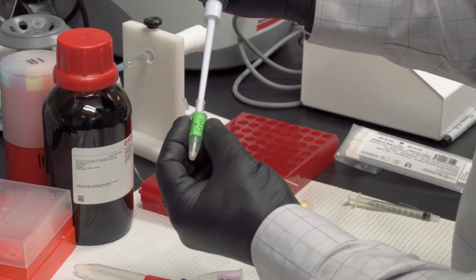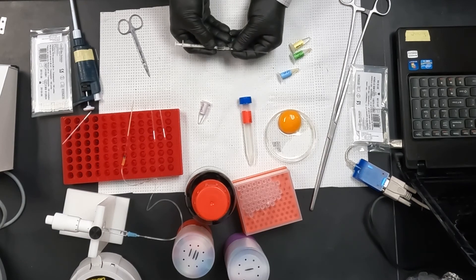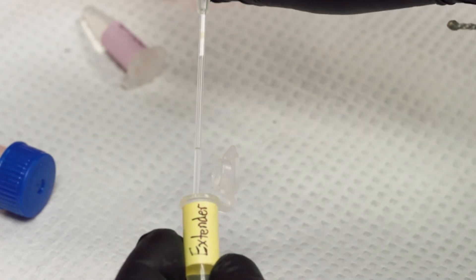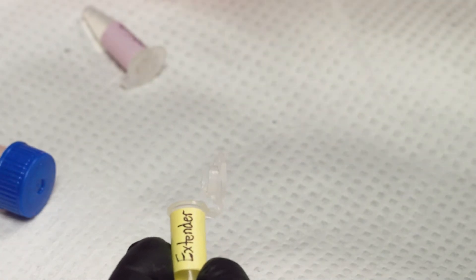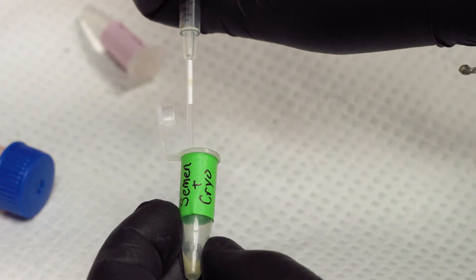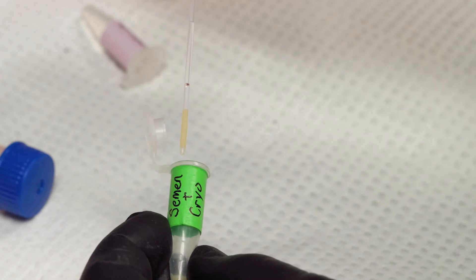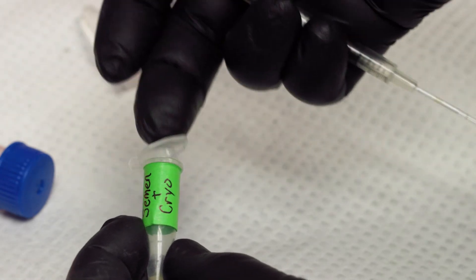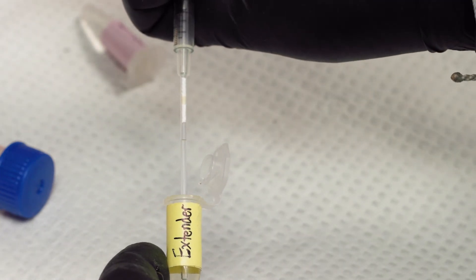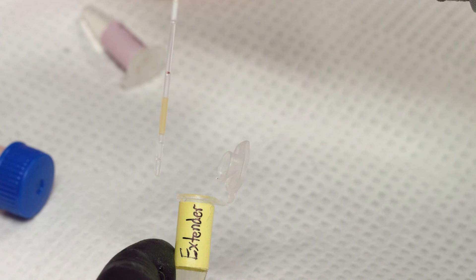The combined semen and cryodiluant is then loaded into the cryostraws, starting with a small amount of diluant or saline, then an airspace. The semen mixture is added next, then another airspace, then another small amount of saline or diluant, and finally a small airspace is added at the end of the straw.